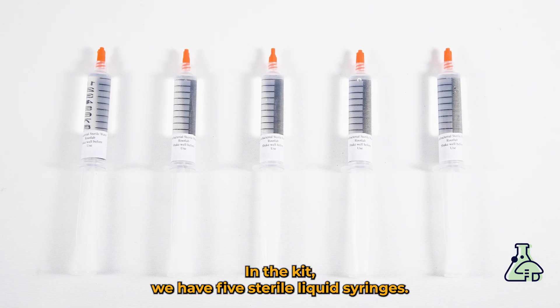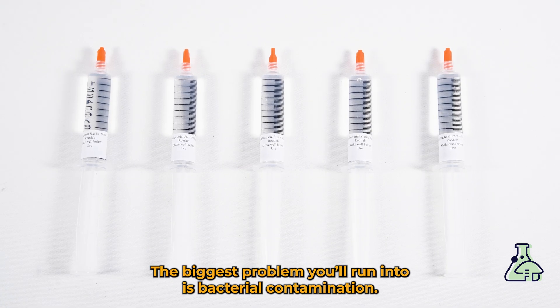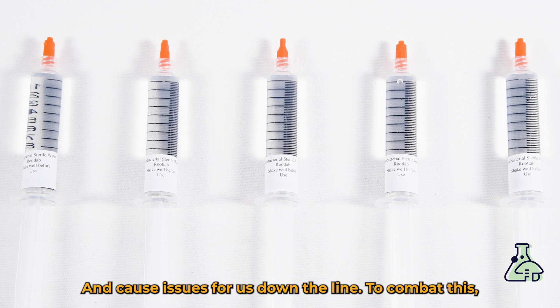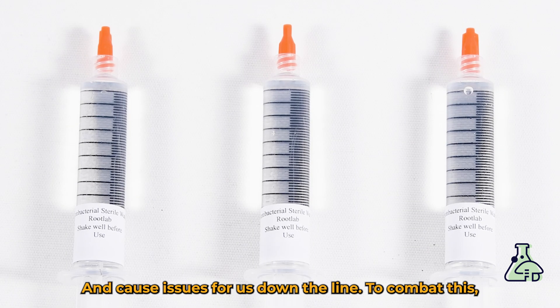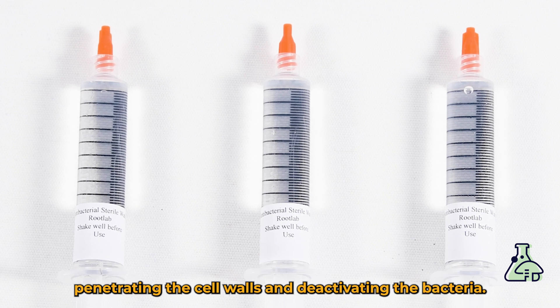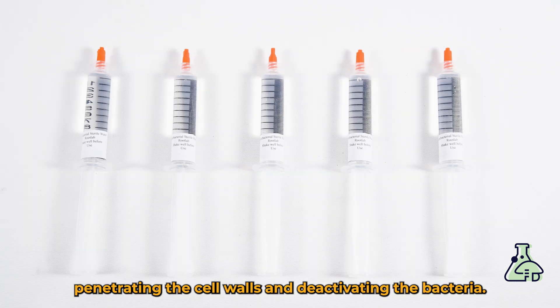In the kit we have five sterile liquid syringes. The biggest problem you'll run into is bacterial contamination. Bacterial spores are smaller than fungal spores, so when they stick to fungal spores they can hide and create issues for us down the line. To combat this, these have antibacterial sterile water in them, which will hydrate the bacterial spores, penetrating the cell wall and deactivating the bacteria.